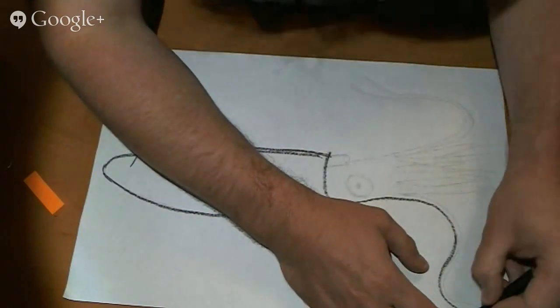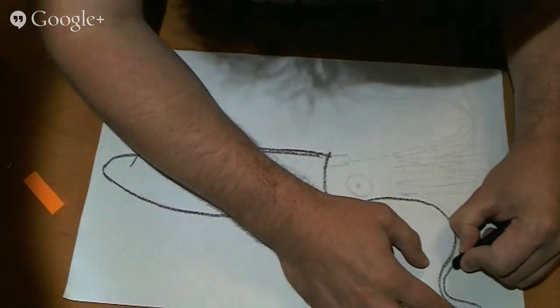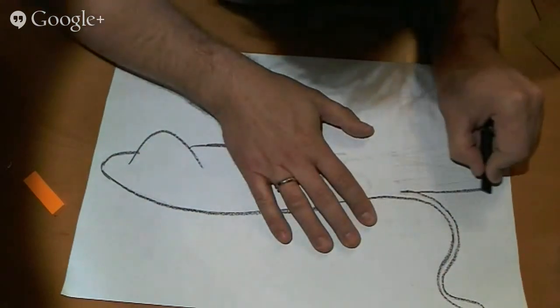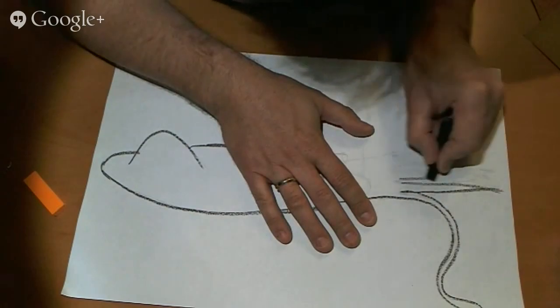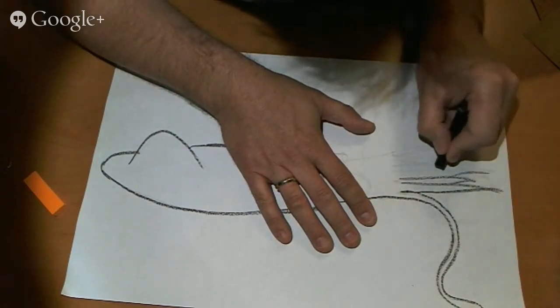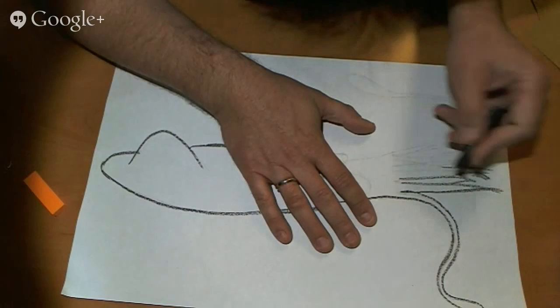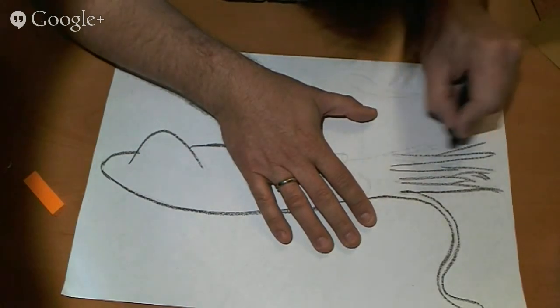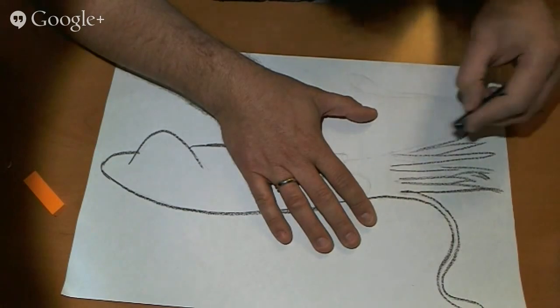And I know you've all seen the picture that was on the front, or the promotion for this particular thing. And that was the same idea as this.